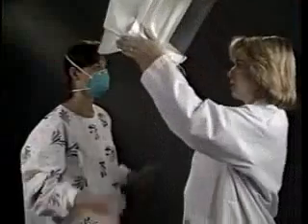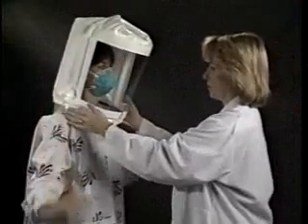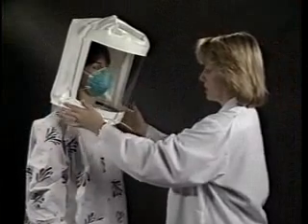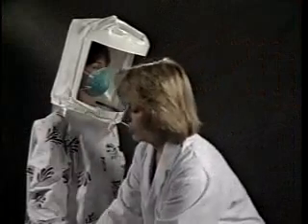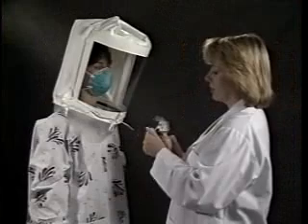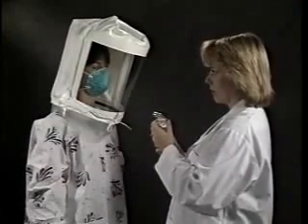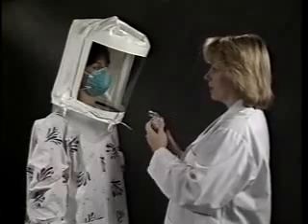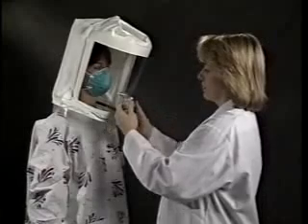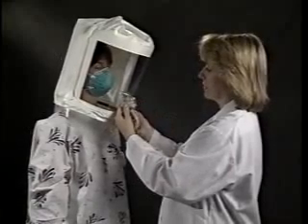Instruct the subject to place and position the test hood as before. Then have them breathe normally through the mouth with the tongue slightly extended. Instruct the subject to notify the instructor if the sweet taste is detected at any time. Using nebulizer 2 containing the number 2 fit test solution, inject the fit test aerosol using the same number of squeezes used in the sensitivity test, 10, 20, or 30.